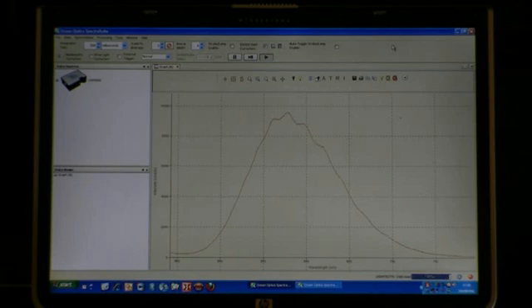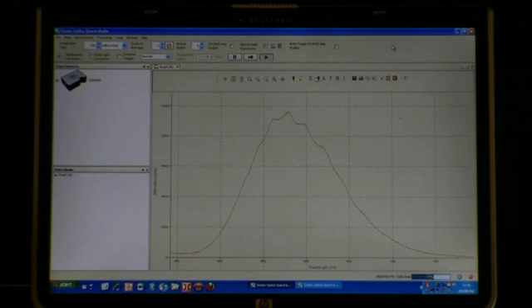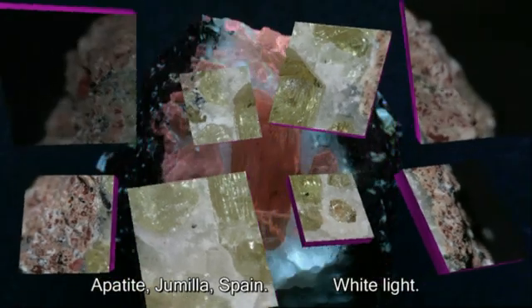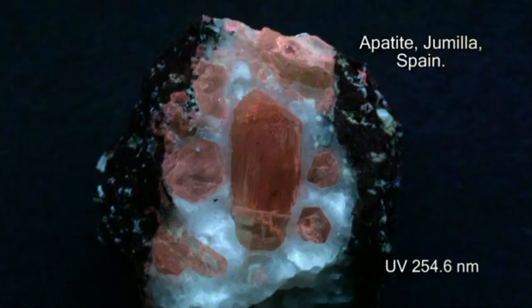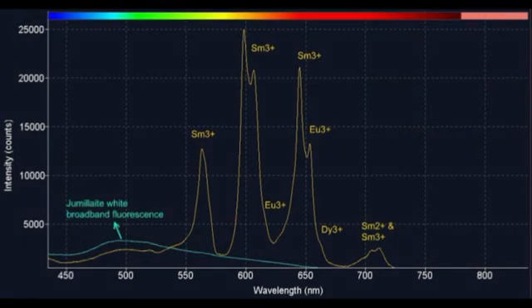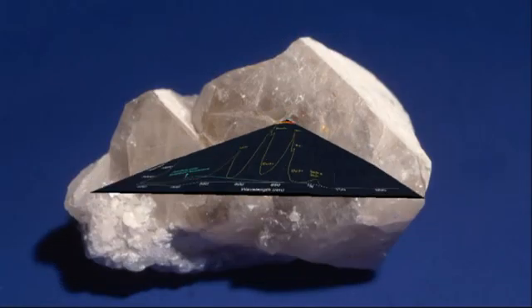I'm going to show you a few more examples by means of still photography and spectra that I recorded earlier. Thanks to our USB 4000 spectrometer, we were able to explain the fluorescence of this Spanish apatite. We discovered that it has copious amounts of samarium, europium, dysprosium, and other rare earths.